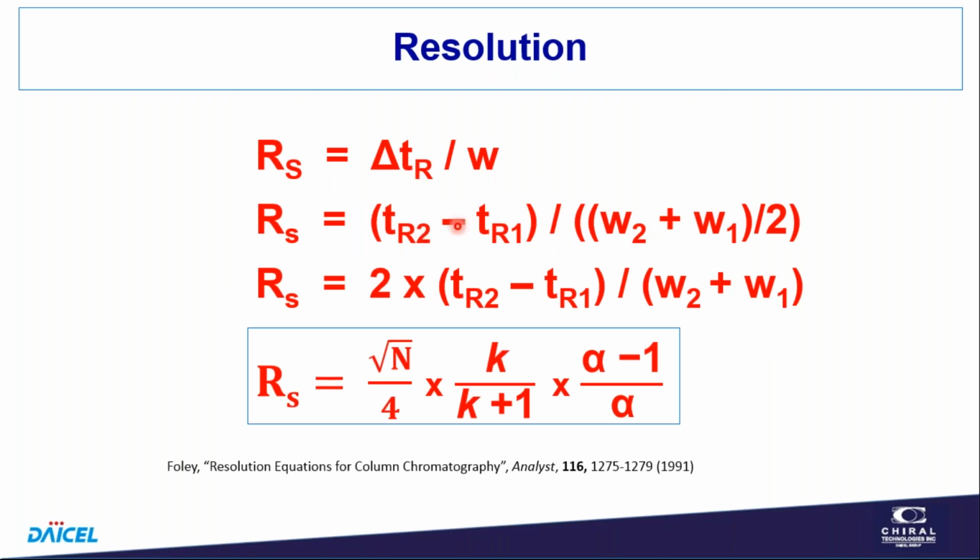It's just the difference in the retention times of the two analytes, and then some measure of the peak width, such as the arithmetic mean of the two components. We have a divisor in the denominator, so that just comes up into the numerator, and this makes it an arithmetically more straightforward calculation. There's less ambiguity or confusion about what to do with a 1 over a reciprocal in the denominator. But if we make some substitutions, do some algebra, we get an equation that looks like this.